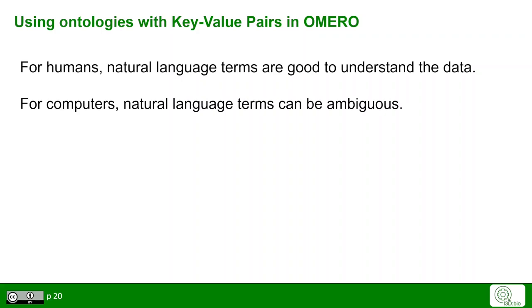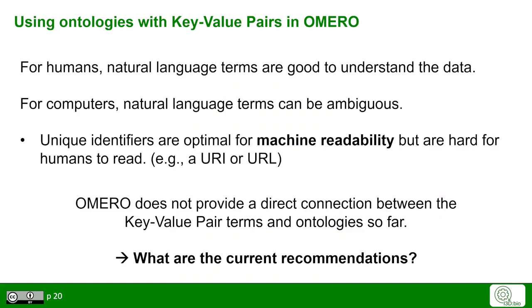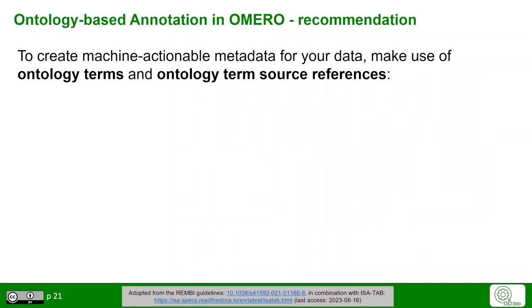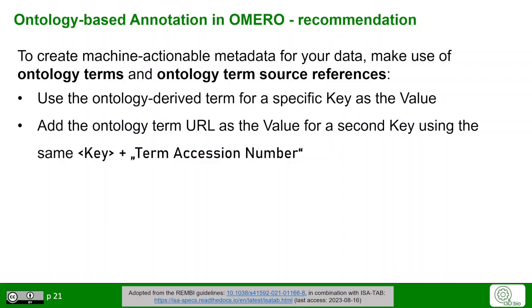In the next subchapter, we will focus on ontologies for key-value pairs. As a preview: for humans, natural language terms are easy to understand because we can grasp context, but for computers, natural language terms can be ambiguous — computers rely on unique identifiers to make data machine readable. However, URIs or URLs are hard for humans to read. In OMERO, there is no specified way to link key-value pairs with ontologies, but our current recommendation is to use key-value pairs for both ontology terms and natural language terms, including the ontology term reference. Use an ontology-derived term as the value for a specific key, then add a second key-value pair with the ontology term URL, using the same key name with the string "term accession number" appended, based on the ISA tab recommendation.